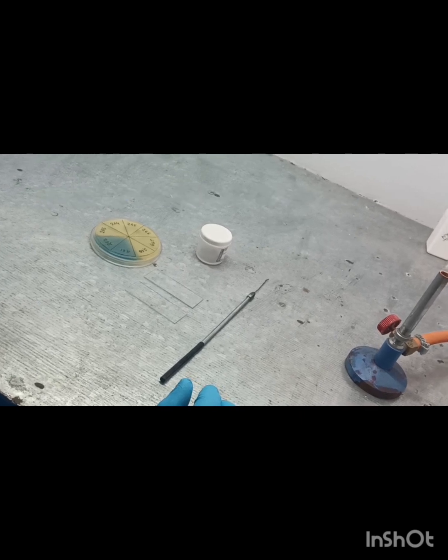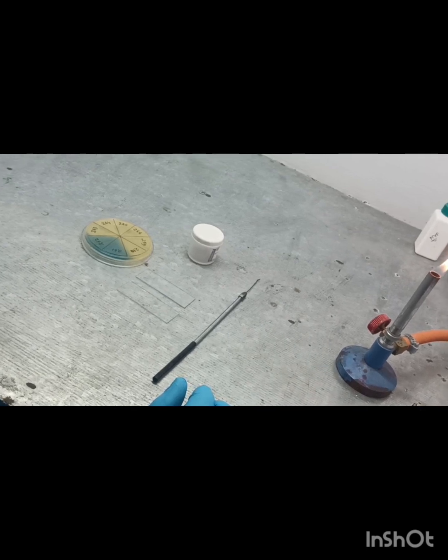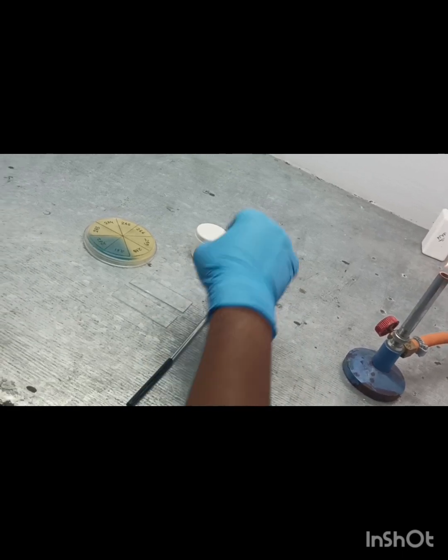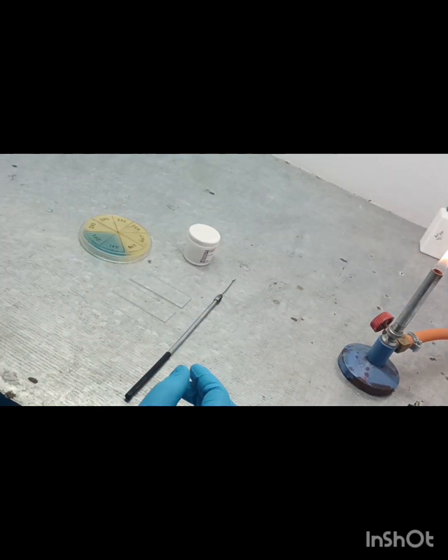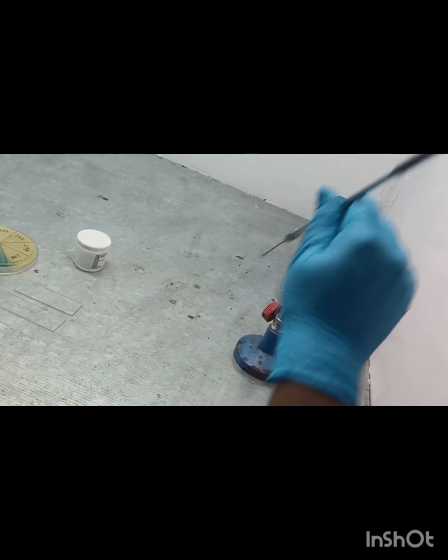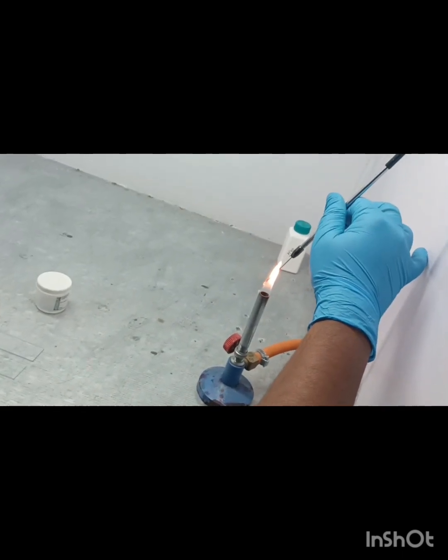Before gram stain procedure, we have to prepare a smear. Before smear preparation, we need a glass slide, nichrome loop, distilled water, and obviously we need a culture colony. First, we have to sterilize the nichrome loop.